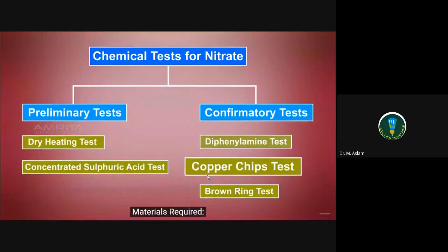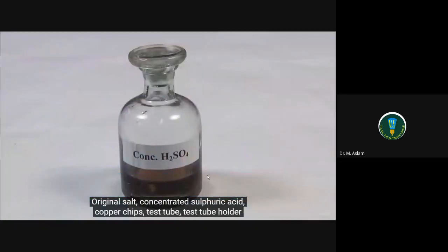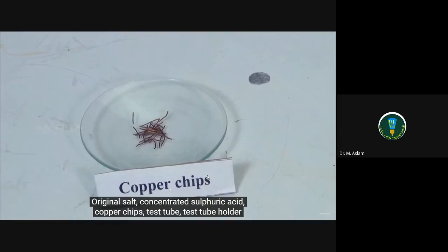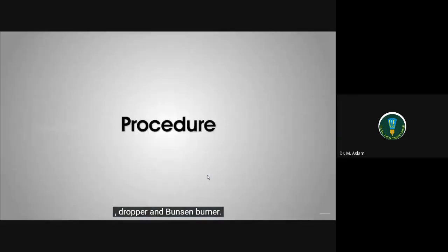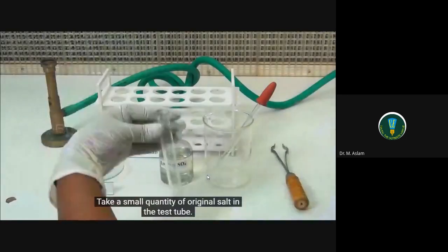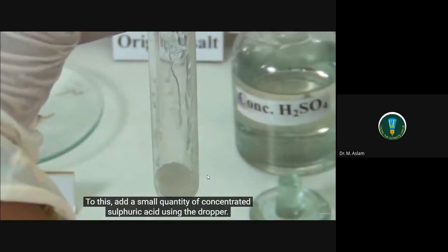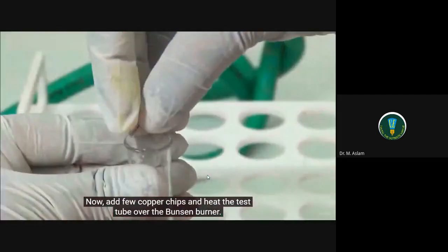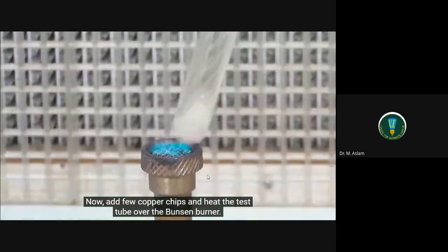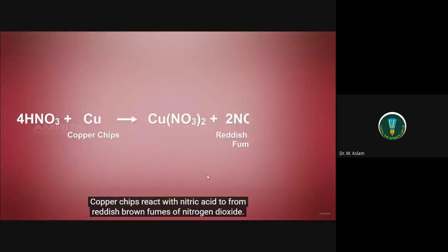Copper chips test. Materials required: original salt, concentrated sulfuric acid, copper chips, test tube holder, dropper, and Bunsen burner. Procedure: take a small quantity of original salt in the test tube. To this, add a small quantity of concentrated sulfuric acid using the dropper. Nitrate reacts with concentrated sulfuric acid to form vapors of nitric acid. Now, add a few copper chips and heat the test tube over the Bunsen burner. Copper chips react with nitric acid to form reddish-brown fumes of nitrogen dioxide.